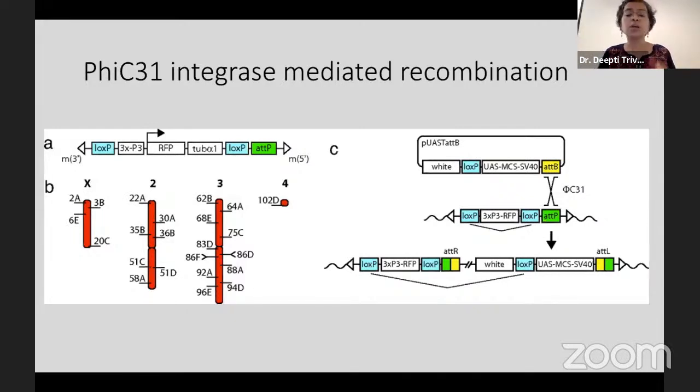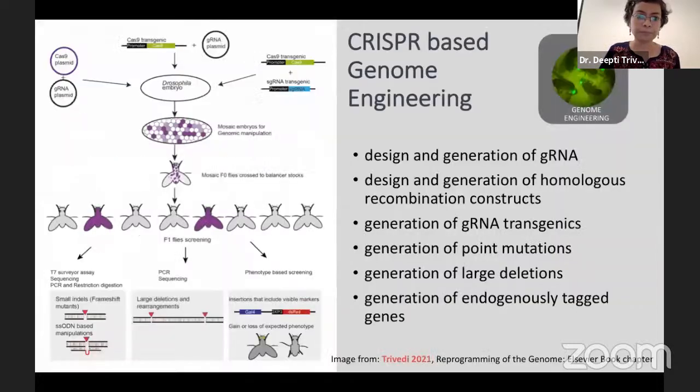And if we were to compare 2 or 3 different transgenics, we can reliably put them in the same locus so that we can actually compare them. Because if one transgene is sitting in one chromosome and the second transgene in another chromosome, we cannot compare them. So these are the kind of loci that we offer, some of them, not all, for transgenesis.